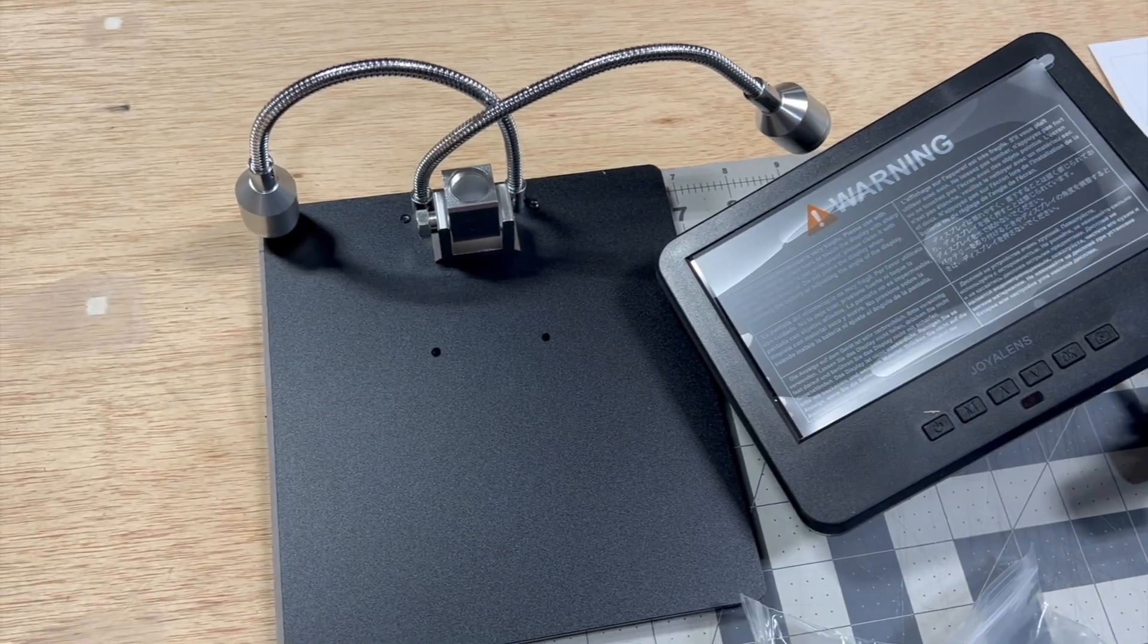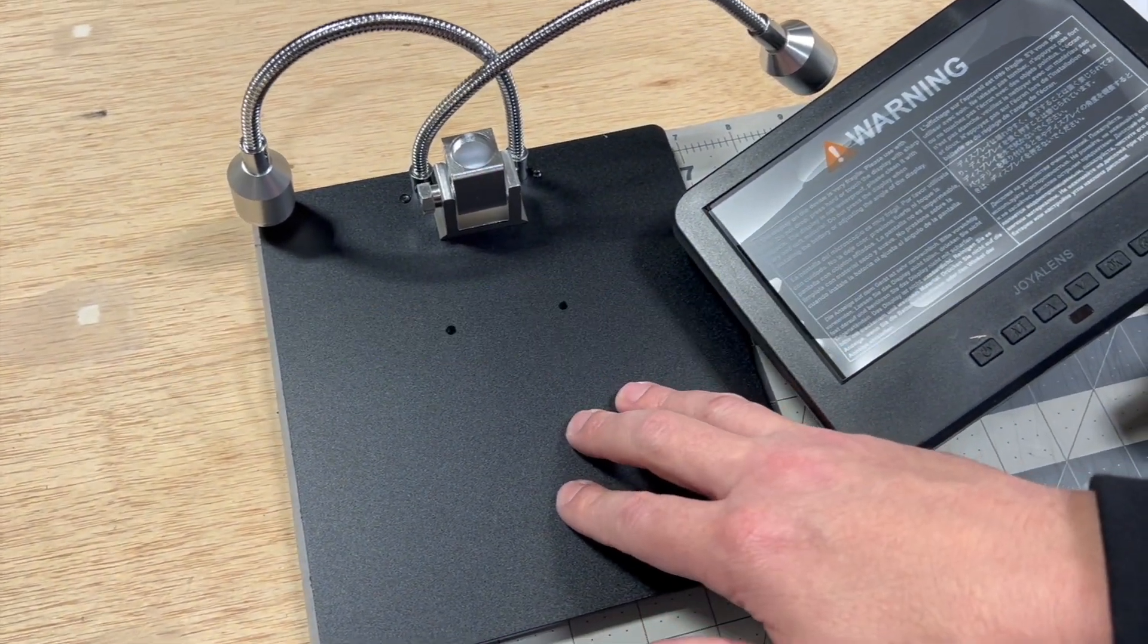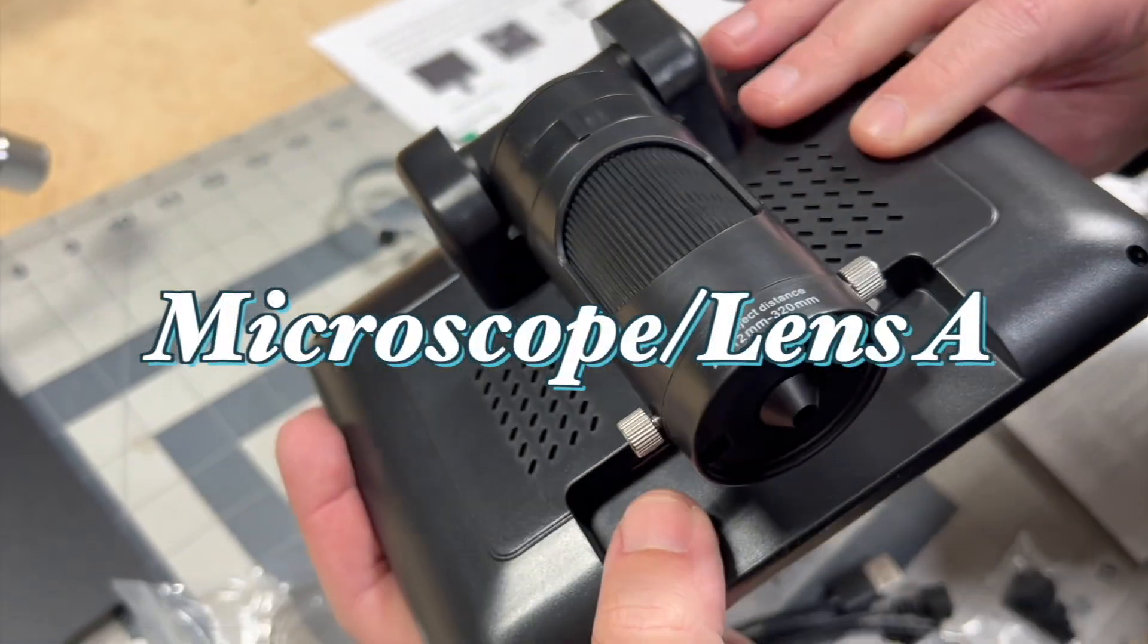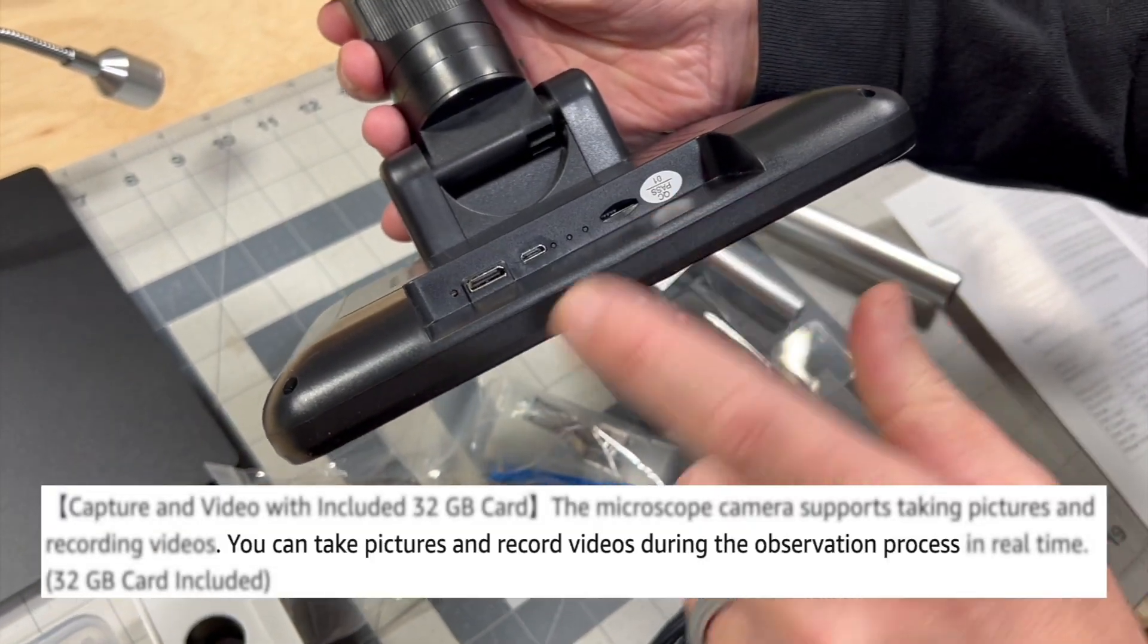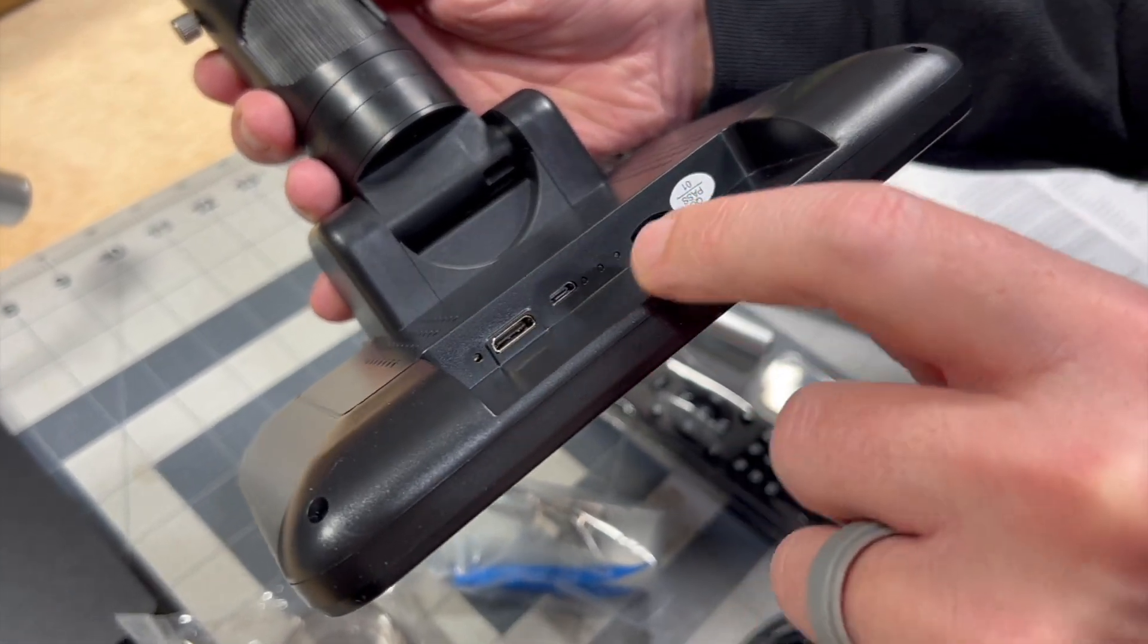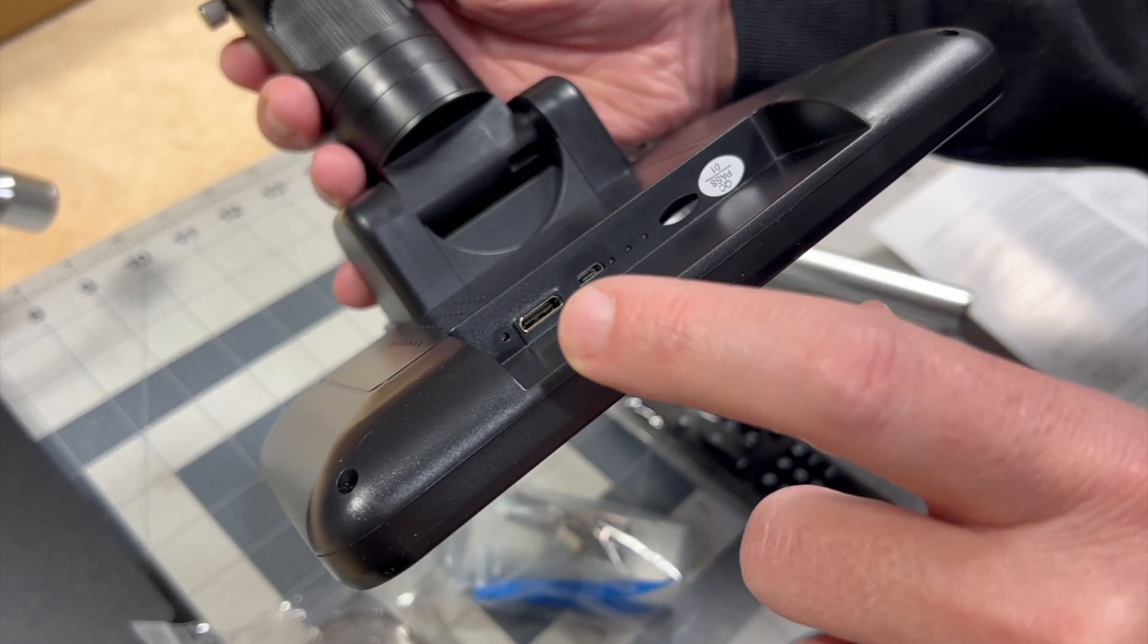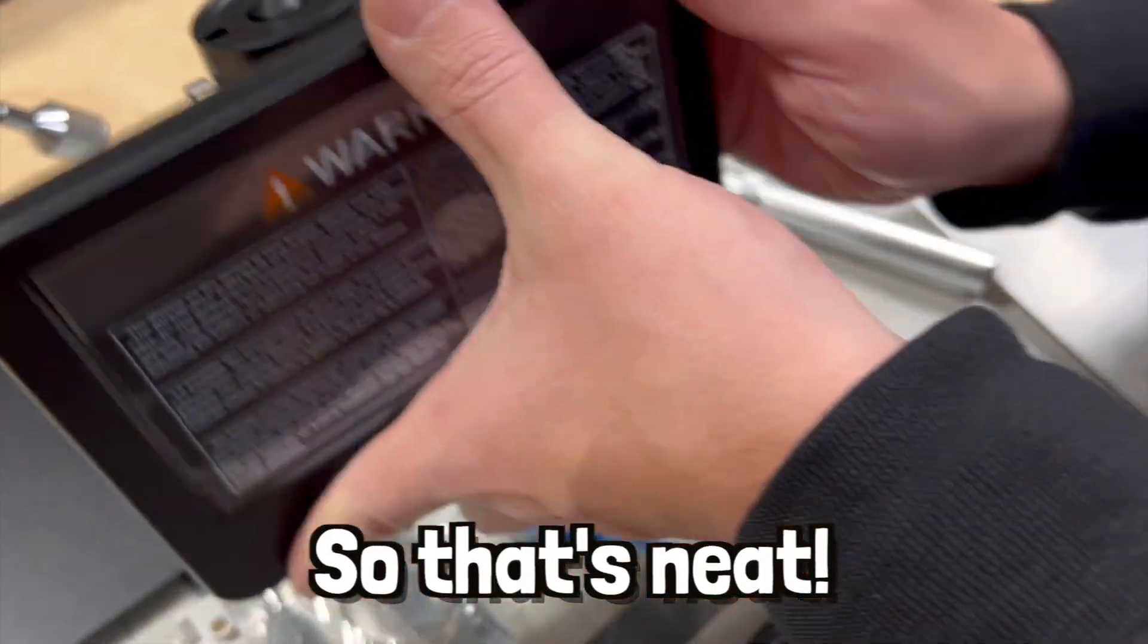Okay, so it actually comes with quite a bit of things. So here's our base that we're going to attach everything to. Right here is our video unit as well as the microscope itself that's connected to it. Really cool about this microscope is you can record on an SD card and it does come with a 32 gigabyte mini SD card. And you can also export it out to a computer via USB or HDMI, which is going to be pretty nice to be able to overlay into our videos when we inspect things.